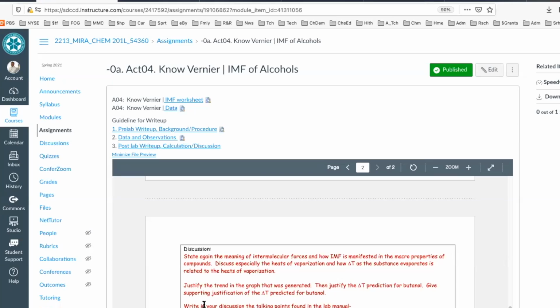The data that you collect, the background information you provide, the table of results you have, and your discussion all support that. So your discussion should go back to the data that you have in supporting the objective of this experiment. That's why you have these things outlined the way they are. That's why you have the format.